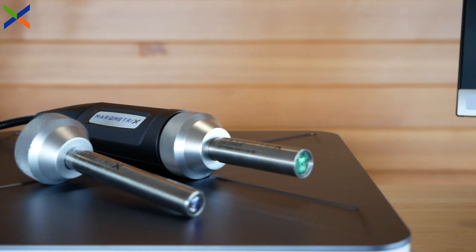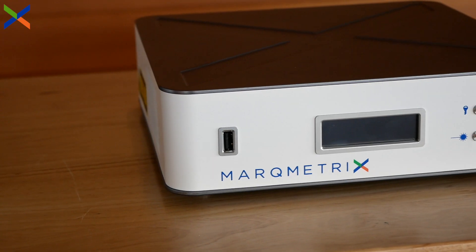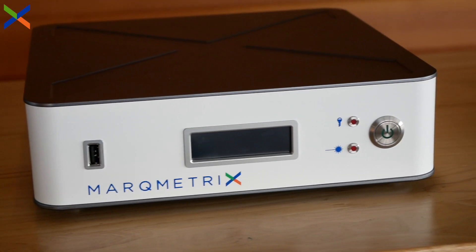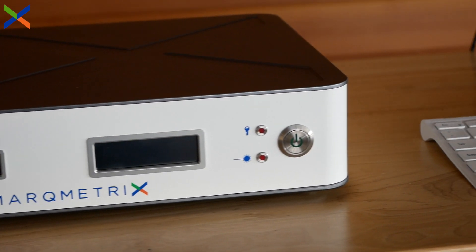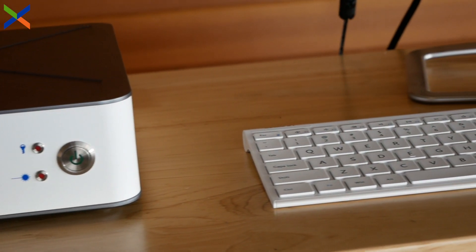There is no need to sacrifice range to achieve large-volume Raman sampling. When coupled to a MarqMetrix all-in-one process Raman system, the Proximal Ball Probe line offers a full spectral range measurement with accurate analysis in seconds, resulting in better real-time decision making and improved process control.